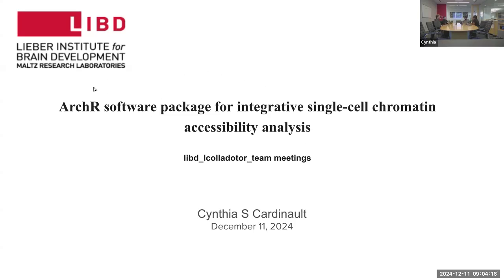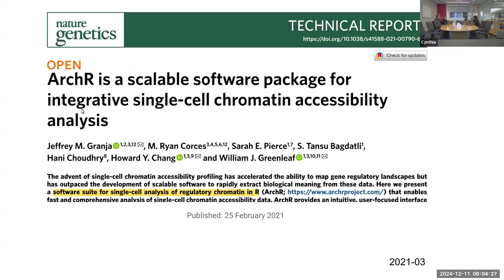Today I'm going to present ArchR, the R software package for integrative single cell chromatin accessibility analysis. This article was published in February 2021, and it was conducted by the Greenleaf Lab, together with Jeffrey Granja and collaborators.